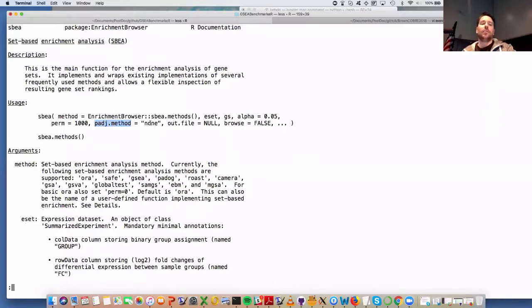So why is that? Well, gene set enrichment analysis is a lot about ranking. You have these two questions: are they statistically significant, and how do they rank to each other? Sometimes they might not even be statistically significant, but you still would like to rank them in order to compare between them. And this is what we are currently analyzing, how much multiple testing correction flattens out the signal. When I did it empirically myself, and we also have some results on that, I found that many multiple testing approaches flatten out the signal in my ranking completely, and I do not have this ranking ability anymore.